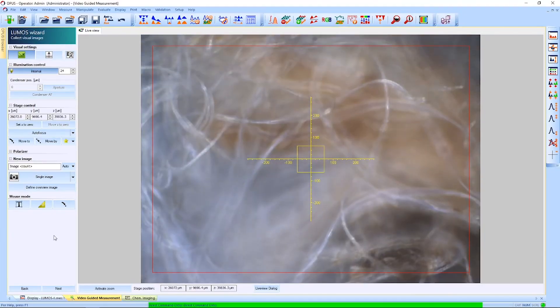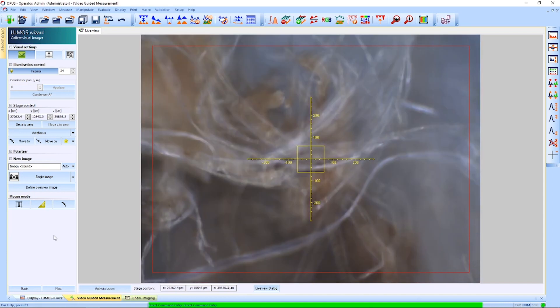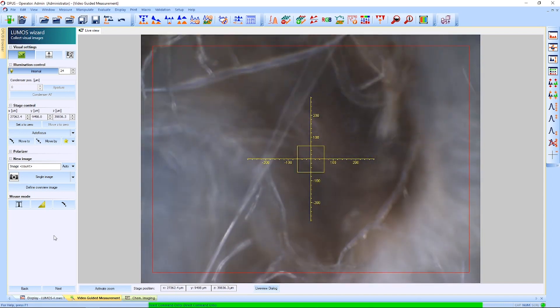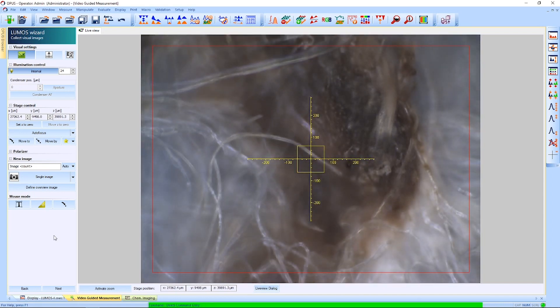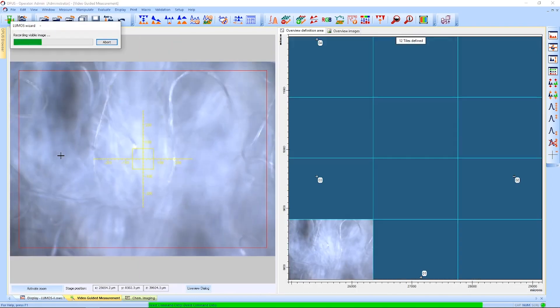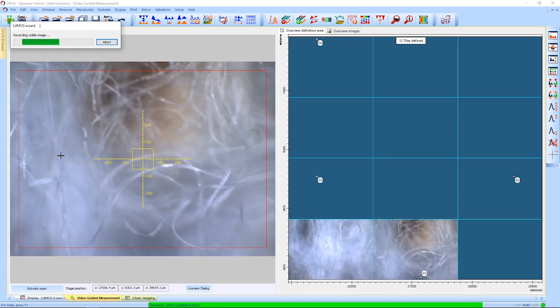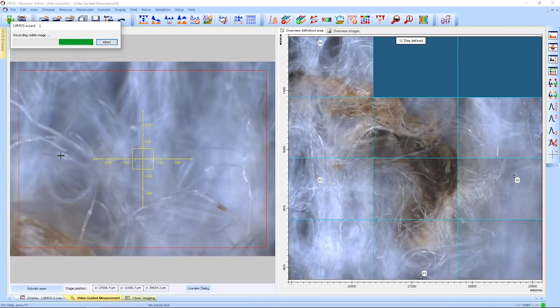We can see that the contamination looks quite different from the rest of the fleece. To help us analyze this spot better, we'll make an overview image of this region on the sample.